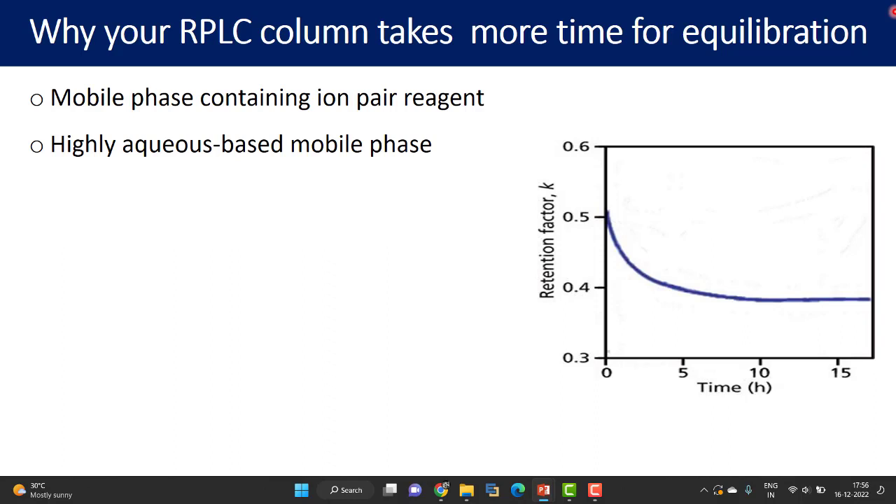Why do people use a highly aqueous mobile phase in the first place? If your compound is highly polar and elutes very early, you may reduce the strength of the mobile phase with more aqueous content. But rather than reducing mobile phase strength alone, you can use polar stationary phases — such as amine, amide, pentafluorophenyl, or phenol stationary phases — which will retain polar compounds for longer. This means you will no longer require highly aqueous based mobile phases.